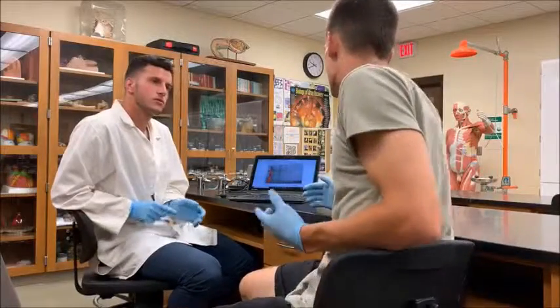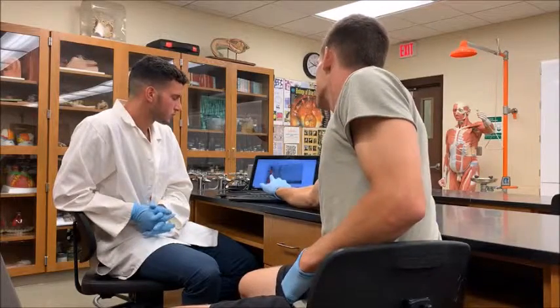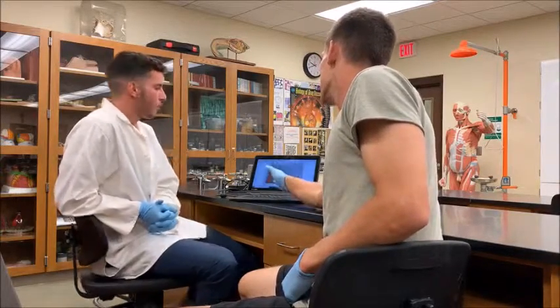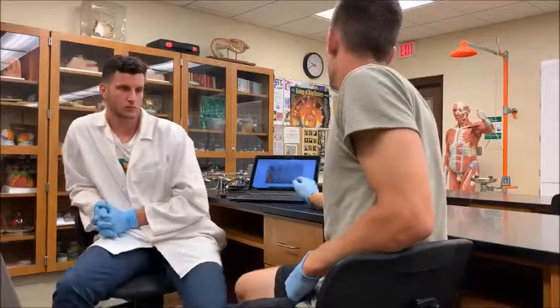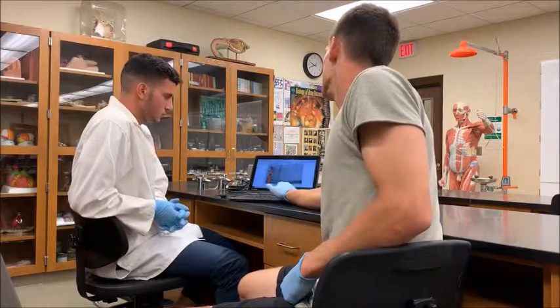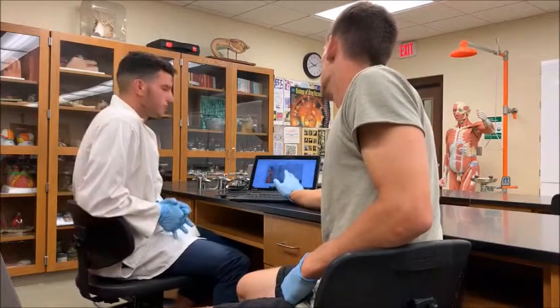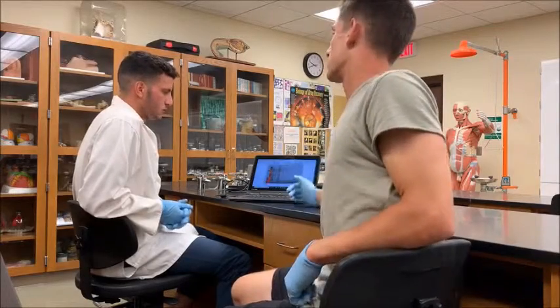Okay, so again here, this would be one of the results that we had from class, and you can kind of see in that first one where all the red is, that would be our molecular weight marker, the thing that we're measuring against. And then as you move on, you have the uninduced, induced, the soluble, the wash, elute, and then finally at the end we have our purified protein, correct?